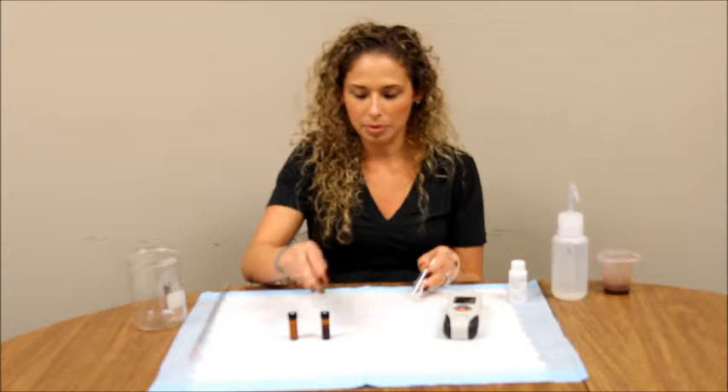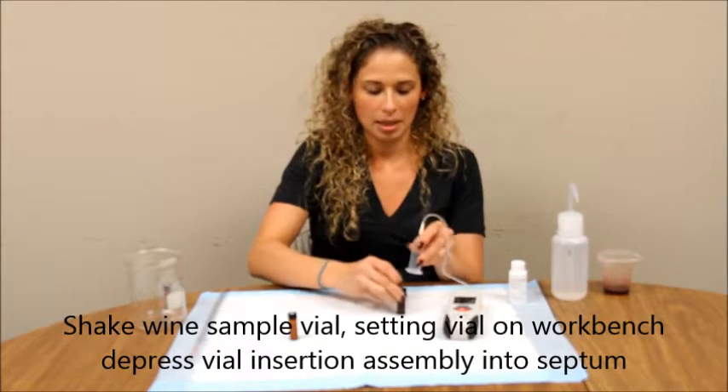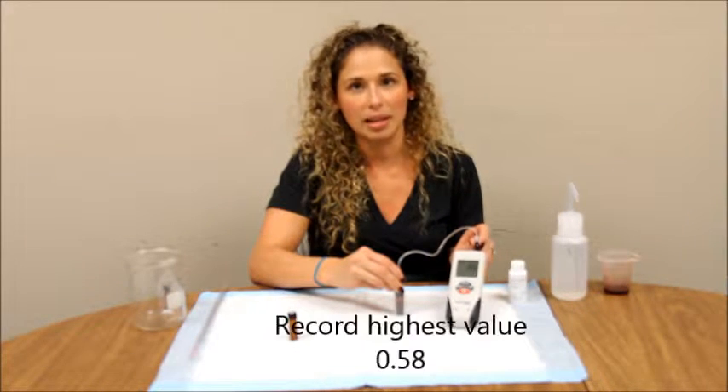Take your wine sample vial, shake one more time, and depress the vial insertion assembly into the septum. Record the highest value.